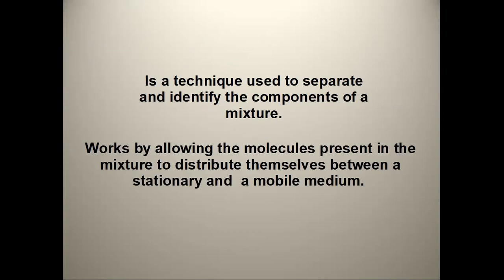Okay, so it is a technique used to separate and identify the components of a mixture. In your experiment, it's the red and blue ink. It works by allowing the molecules present in the mixture to distribute themselves between a stationary and a mobile medium.